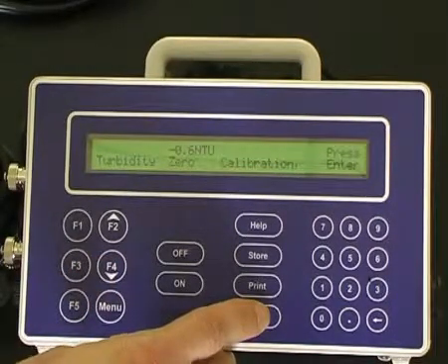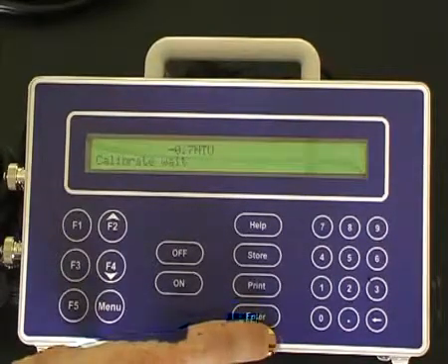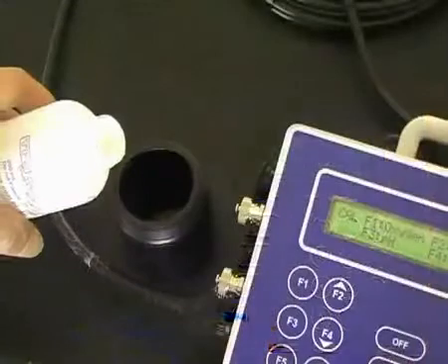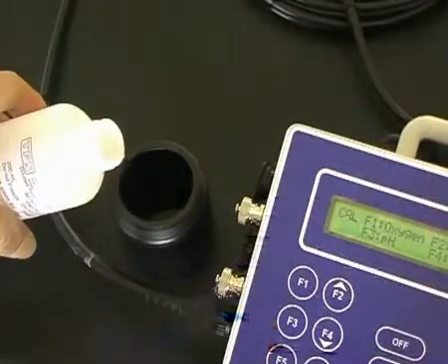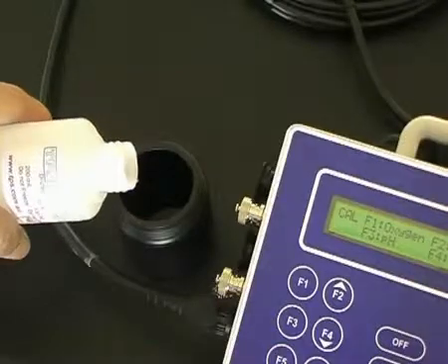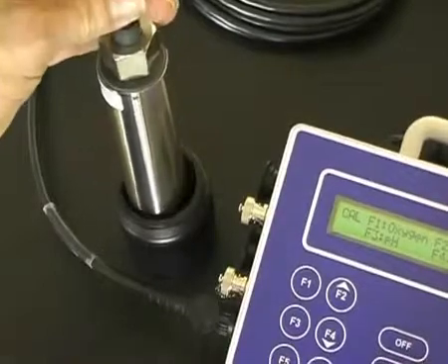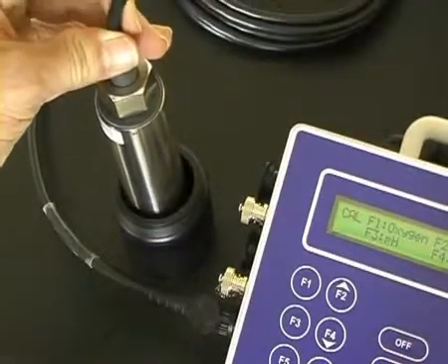The second point turbidity calibration is performed in a turbidity standard, such as 90 NTU like this one here. Pour the standard into a black calibration jar. Place the sensor into the turbidity calibration solution.